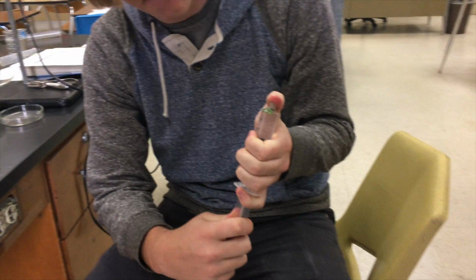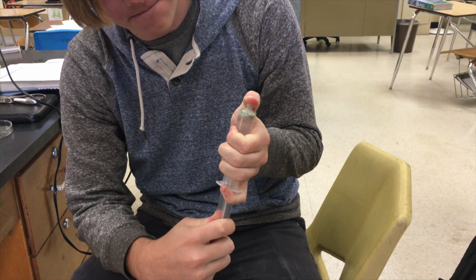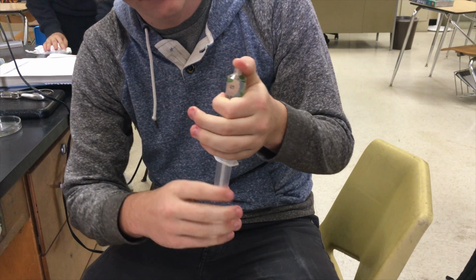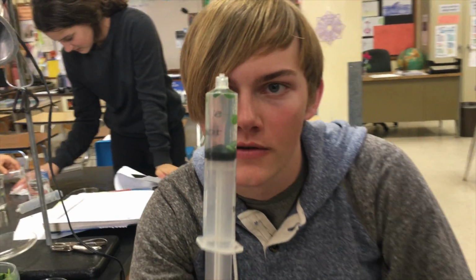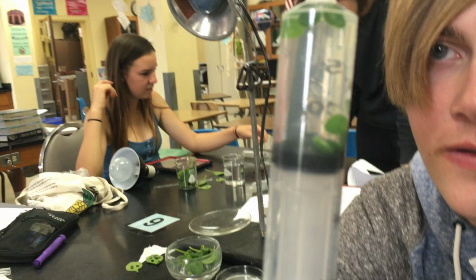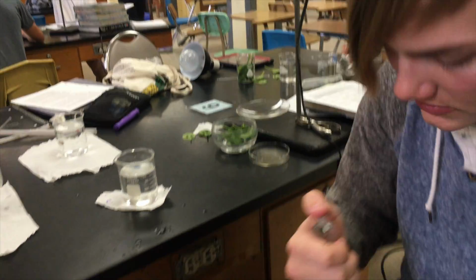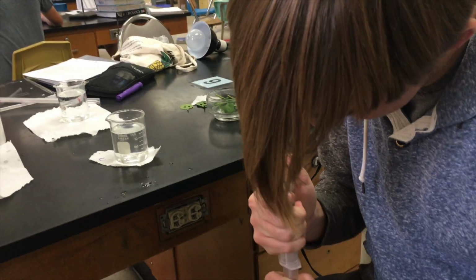Next, hold your finger over the syringe opening and draw back on the plunger to create a vacuum. Hold this for around 10 seconds and swirl the leaf discs at the same time. Then let off the vacuum. You may have to do this a few times, but the final goal is that the bicarbonate solution will infiltrate the air spaces in the leaf and cause the discs to sink.